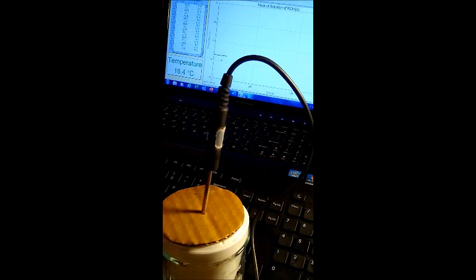While I'm doing that, I'm going to get my KOH ready and make sure it's all going to get transferred quickly to the solution. It's absorbed some moisture from the air, but it should all get transferred. I'll do my best here. You want to do this quickly because I don't want to have the top off the calorimeter for too long. So let's just keep going here. You can see it's around 16.4 degrees C. Here's my coffee cup calorimeter. So here's what I'm going to do.